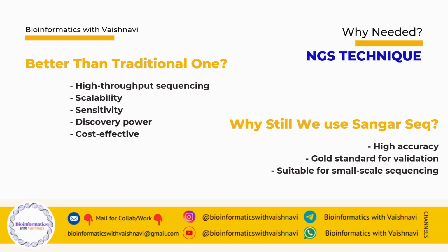Why? Even though NGS is widely used, right? Sanger sequencing is still very important. Sanger sequencing is known for its high accuracy, which is why it is considered the gold standard for validation. It is also suitable when we need to sequence small DNA regions or a few samples.